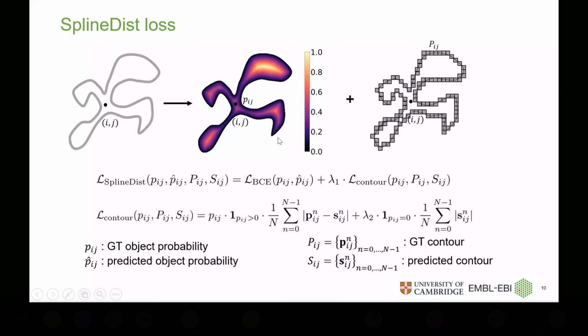So the major difference between StarDist and SplineDist is we no longer require unique ground truths for every single pixel, because for every single pixel, the ground truth is going to be the same contour, right? That we can very well achieve by shifting our predicted contour in terms of relative coordinates, to remain computationally tractable and do efficient ground truth generation.